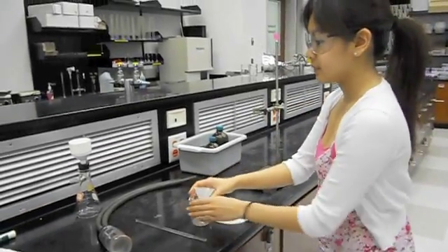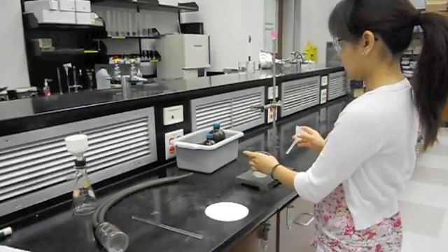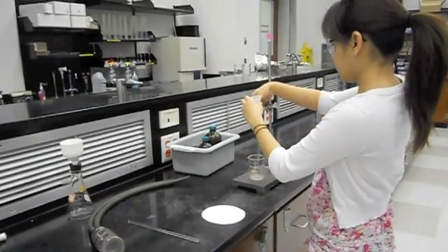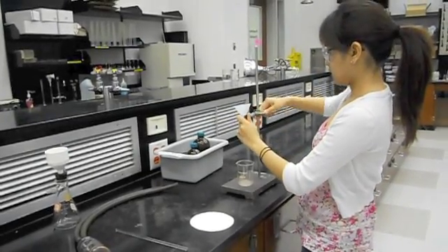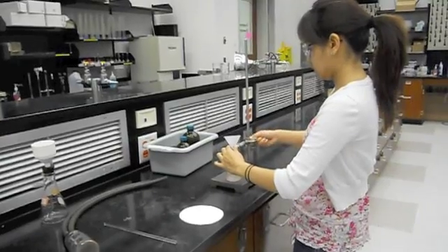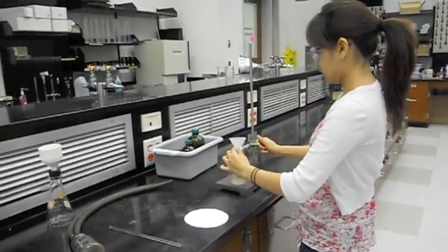Using a ring stand and clamp, place a funnel with a long neck into the clamp and tighten it to hold it in place. Move the clamp down so that the neck of the funnel is inside the beaker.